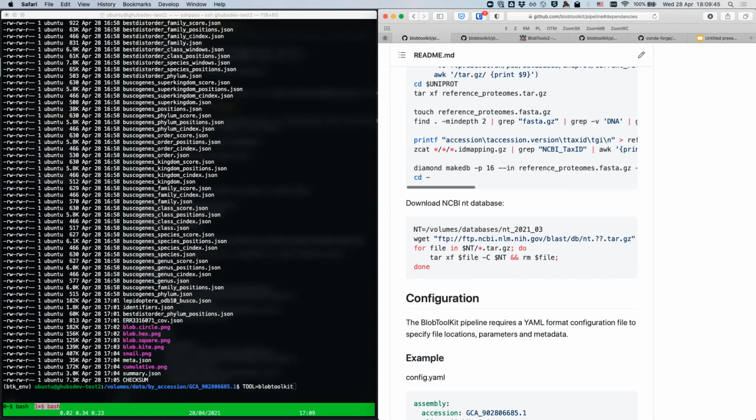And then in your compute node, you change the config file to point to these folders and it'll get everything from there. It won't try to get it from the internet. Okay, that's what I'd done. I had done all this previously for the version 1 pipeline, and yet when I run the pipeline and tell it where all these formatted databases are, it still was throwing errors about trying to access the internet. I got one error like that even with version 2.